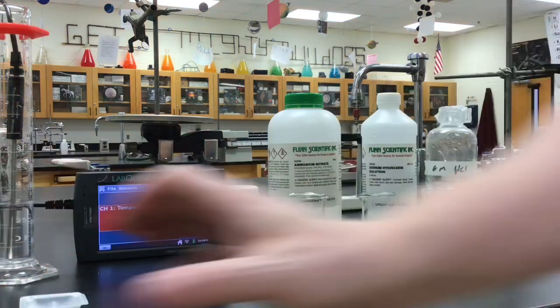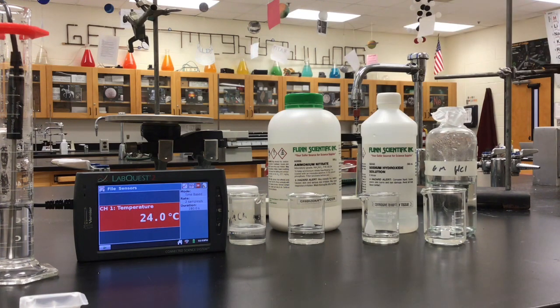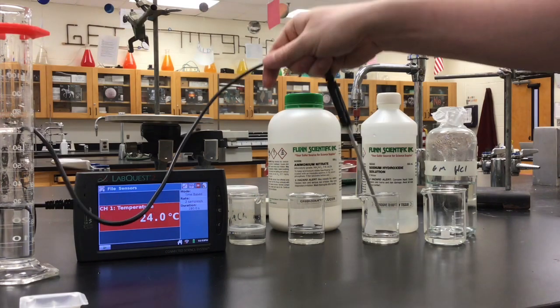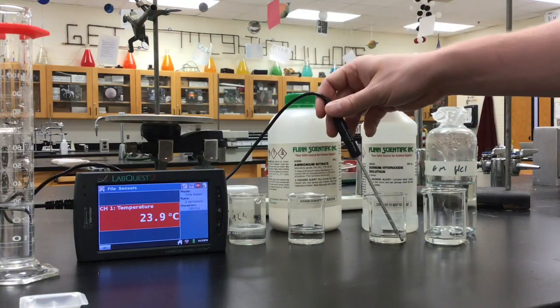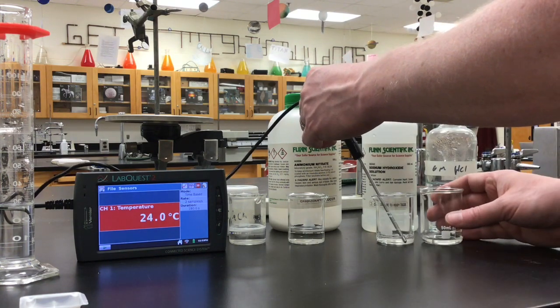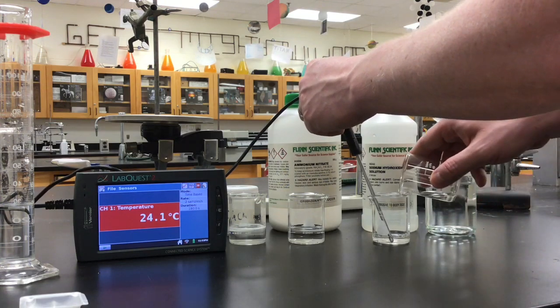For the last reaction here, we've got a mixture of sodium hydroxide and hydrochloric acid. This is different from the other two, which were solution reactions. This one is going to be a neutralization reaction. But we're going to use the same initial temperature here. I'm measuring the temperature of the hydroxide, but make sure you write that down for both. It's 24 degrees Celsius. Now we're going to add our acid and watch what happens to the temperature.